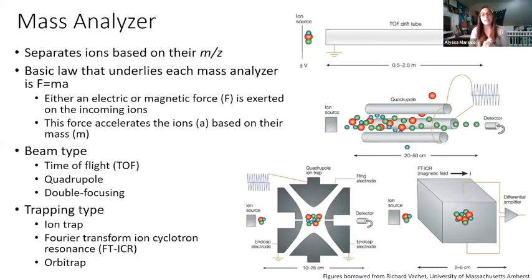Once you generate your ions, they go through your mass analyzer, which is a fancy way of separating different sized ions. One other thing I always talk about in mass spec: whenever you analyze a sample by mass spec, let's say again we have cocaine. And those of you who know me, my favorite drug is cocaine. I know the mass spectrum of cocaine by heart. Don't ask me why, but I do. We're analyzing a sample of cocaine and we throw it through the instrument.